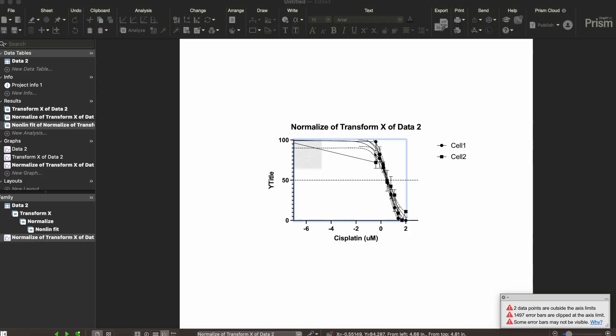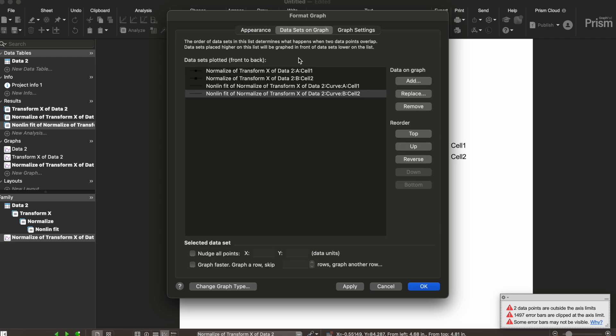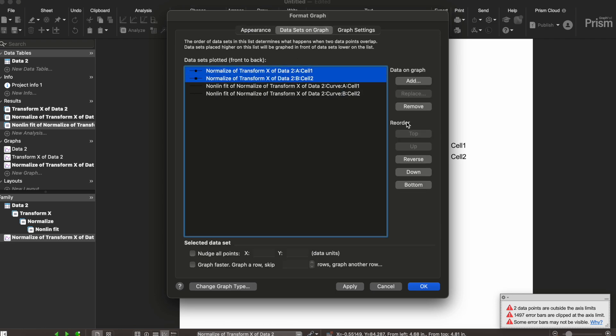And now we're gonna double click the graph. We're gonna look at data sets on graph and we're gonna actually remove the ones that are normalized.